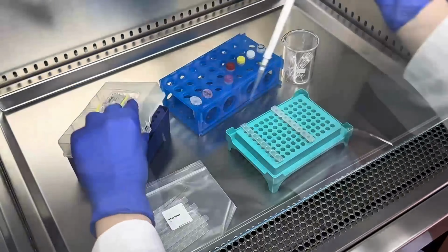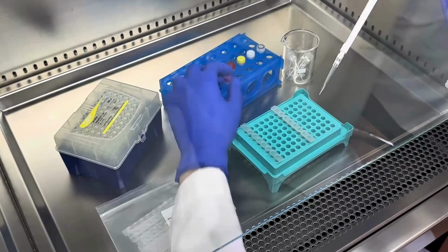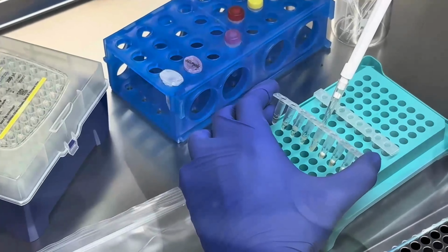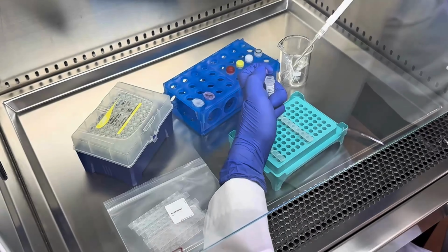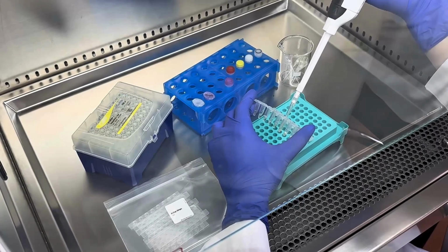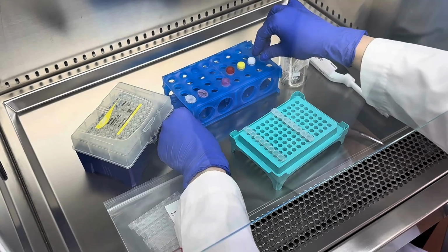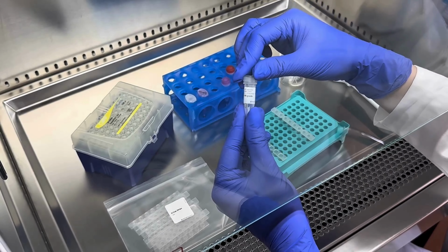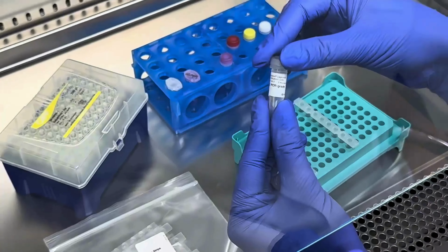For the positive control, pipette 25 microliters of the quantification standard A, which is the purple cap vial. For the negative control, pipette the PCR-grade water, which is the colorless cap vial.